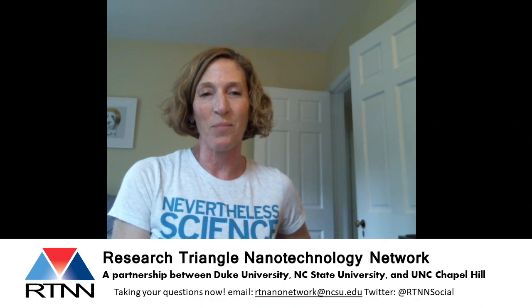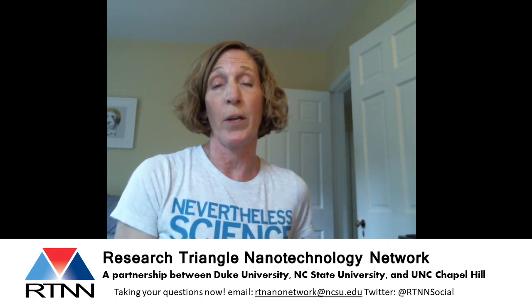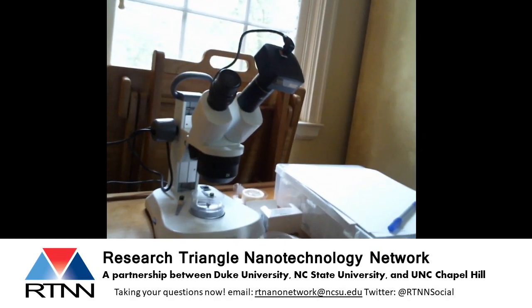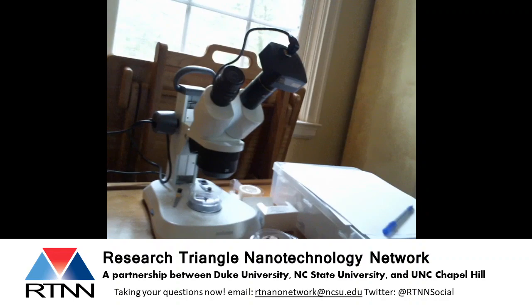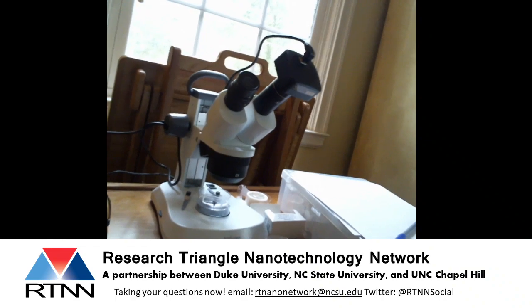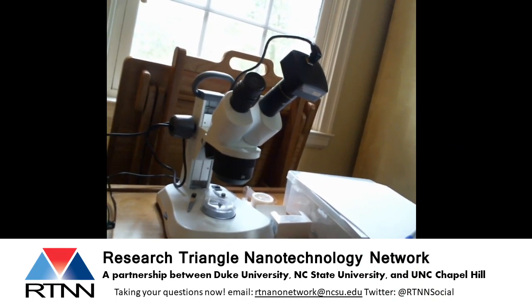So what we're going to do today is look at some microscopes. I've got two different kinds of microscopes. The first one is a light microscope. I'm going to show that to you. That one is sitting right here. You maybe have used a light microscope at school, or maybe you even have one of your own at home. Any kind of microscope is going to help us make little things look bigger. It's going to help us look at the details of little things. It's going to help us see things that are so tiny we can't see them with our own eyes.